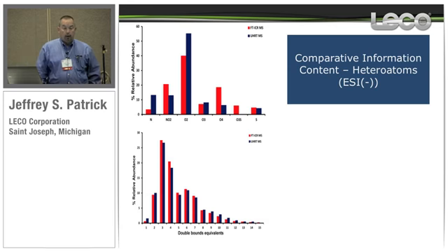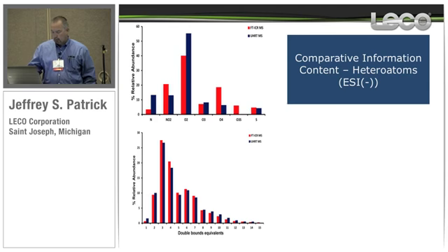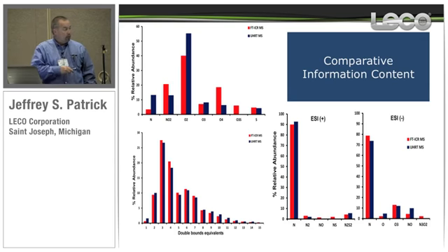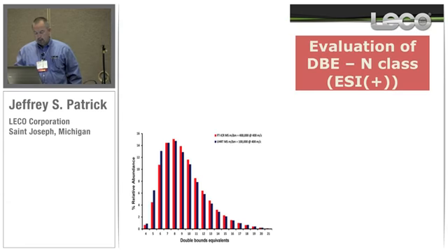And then comparably, the double bond equivalence between the two systems, FTMS and HR-TOF, show very similar distributions. So the information content between these two for an N of 1 is relatively comparable, if not indistinguishable. Again, another comparison, different sample, positive ion ESI, negative ESI, broad ranging distribution. This one much heavier in the N1 class for both, but comparable results from HRT and the FTMS.